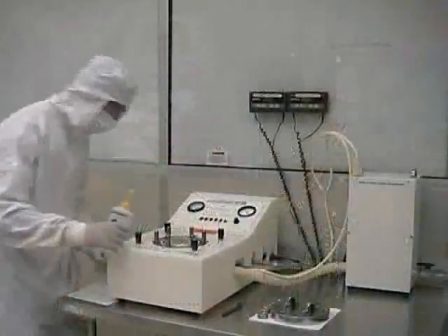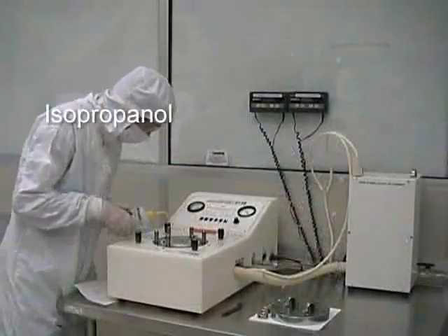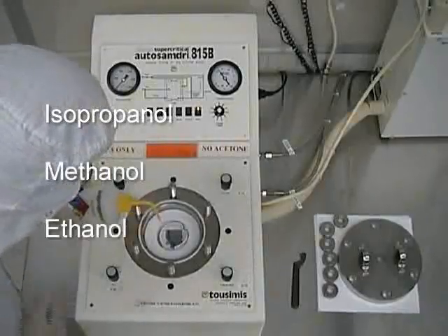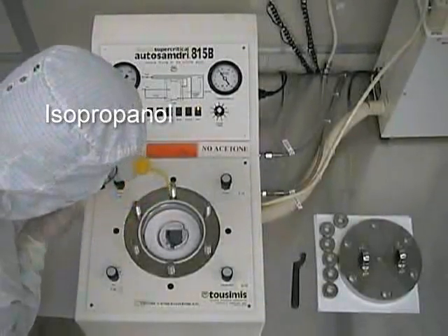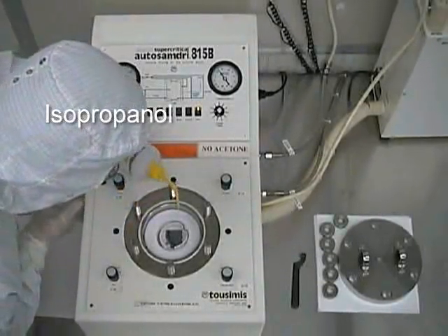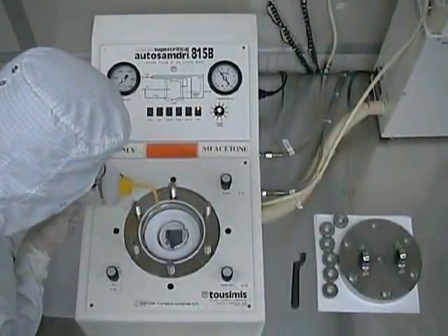Once it is in place, you may introduce ultra-pure alcohol. The list of approved alcohols consists of IPA, methanol, or ethanol. In order to prevent any confusion, we only use IPA here at the MRC. At this point, you should fill the dryer chamber with enough IPA to cover your wafers or your die.